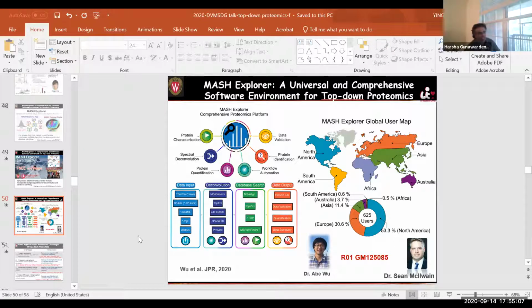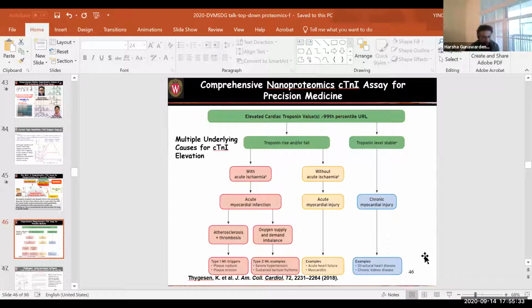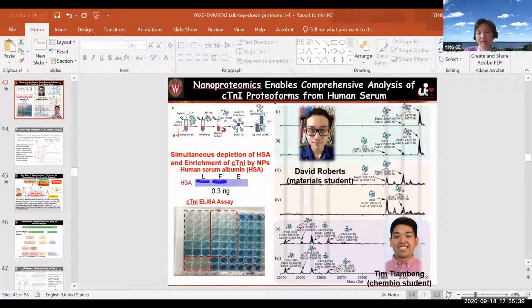Yeah, I have one final question. In terms of, you were looking at troponin as your main protein and looking at post-translational modifications, phosphorylation mostly. Is there some way that you can use this to stratify the patient populations into subgroups based on disease severity or maybe other types of comorbidity or disease state? It's very complex when you talk about biomarkers, right? Your diet can influence the level of glycosylation on a protein.